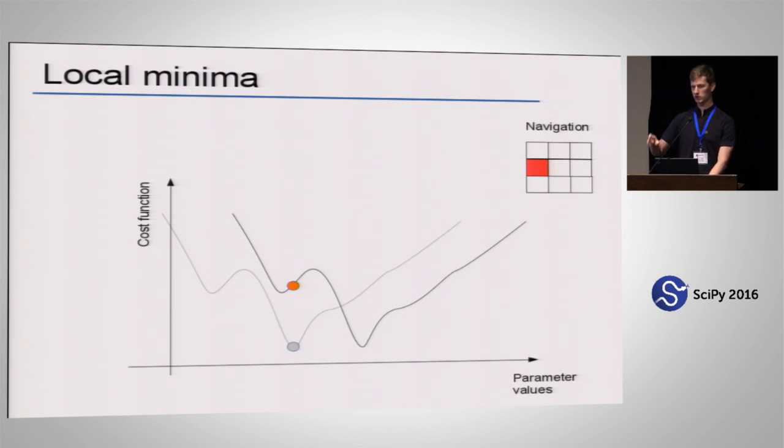The other thing is how it went along the data set. That's essentially because it was just the easiest way to code. It almost never is the actual reasonable way to go fitting the data set, to just go row by row. You probably want to follow some path that the actual data set suggests.